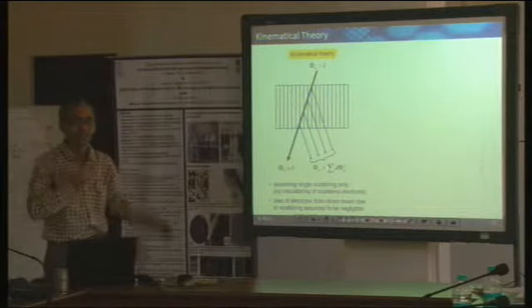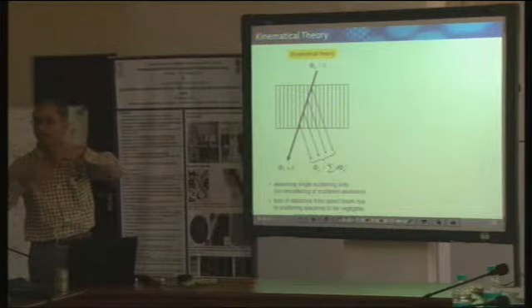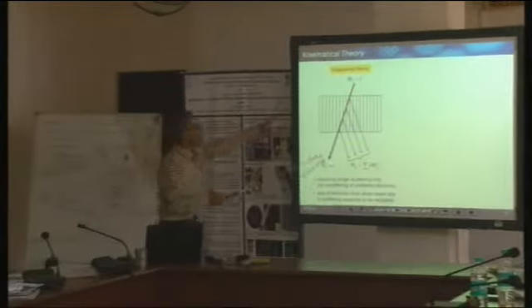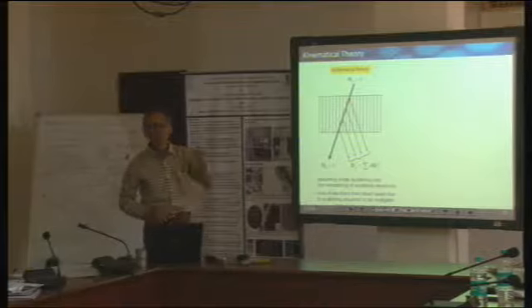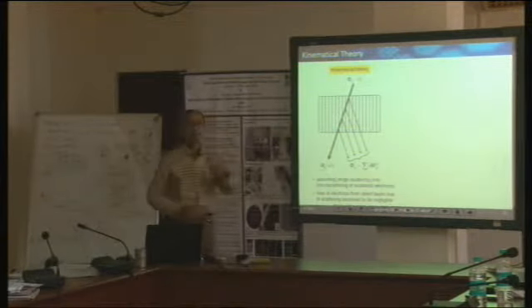I don't mean to say that suddenly the electrons have begun to interact weakly with matter. No, I don't mean to say that. But it could be weak because the sample is extremely thin. It could be relatively weak because my sample contains light elements.